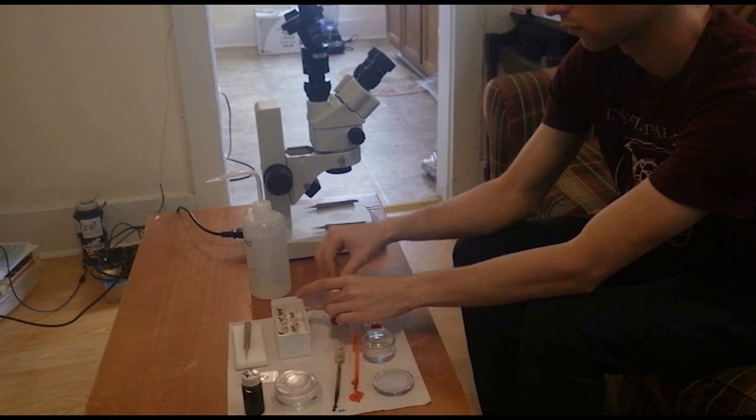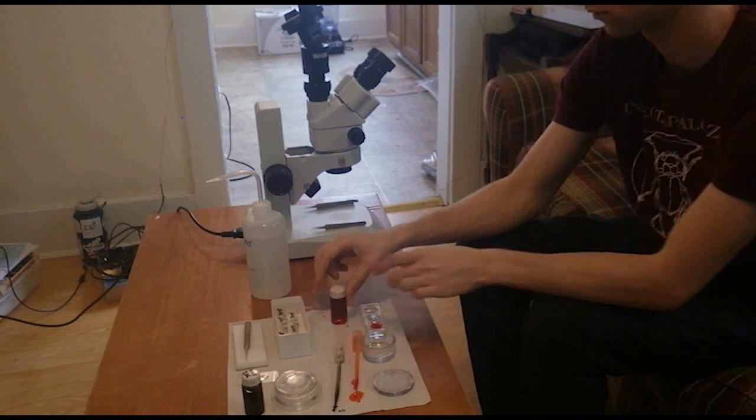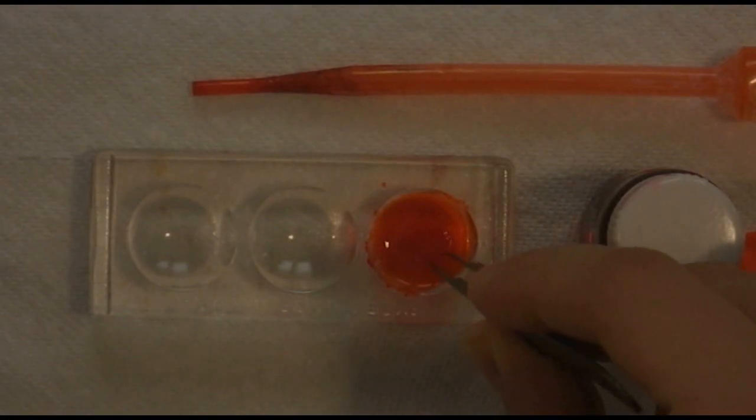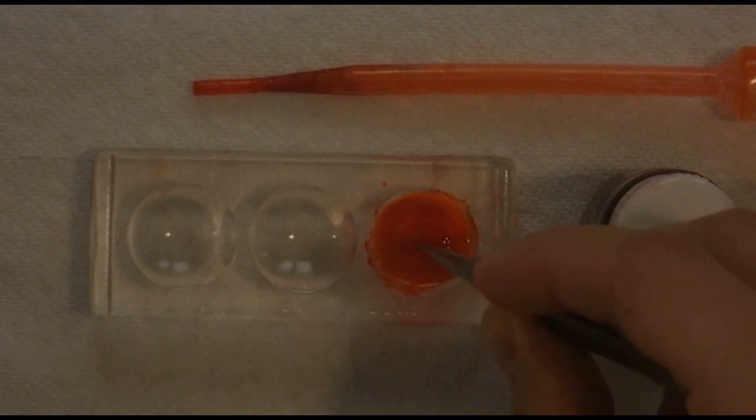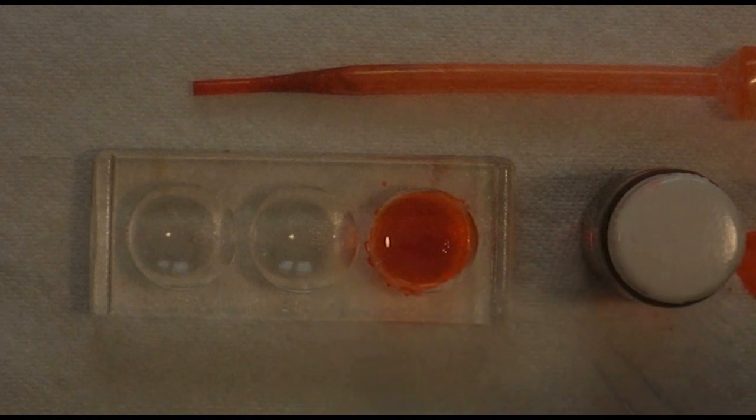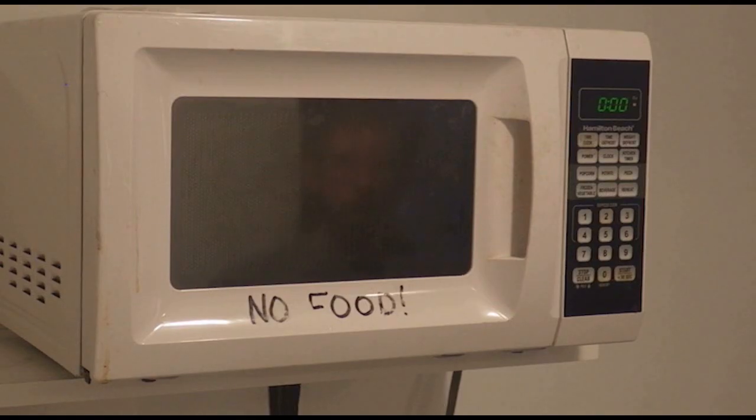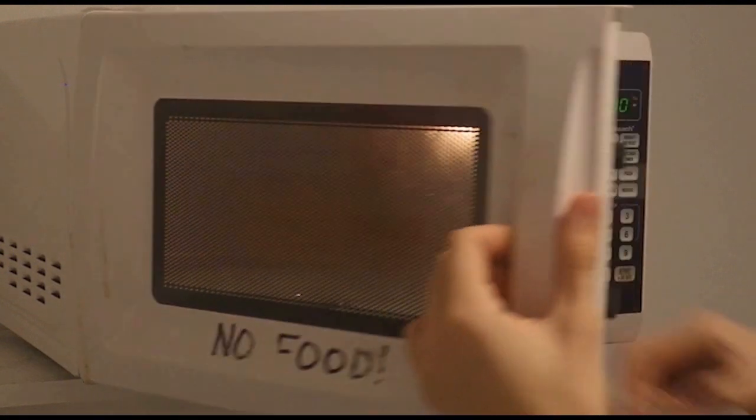Now I can take the genitalia and abdomen and submerge them in the eosin Y to begin the staining process. This can take about 7 to 10 minutes at room temperature or about 3 seconds in the microwave to set the stain.